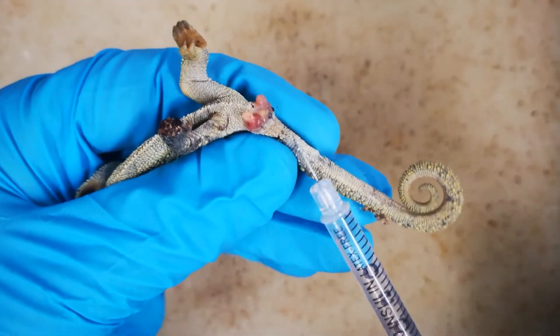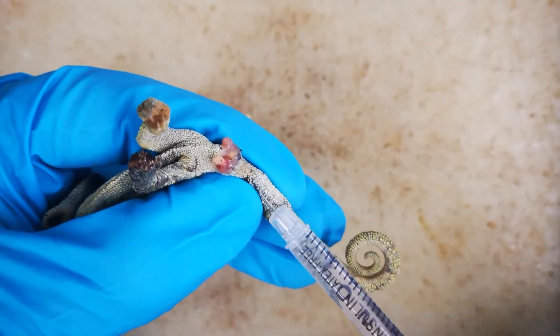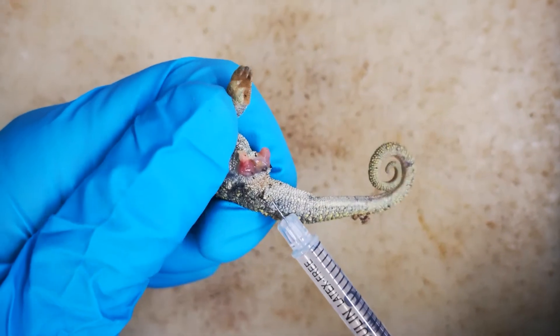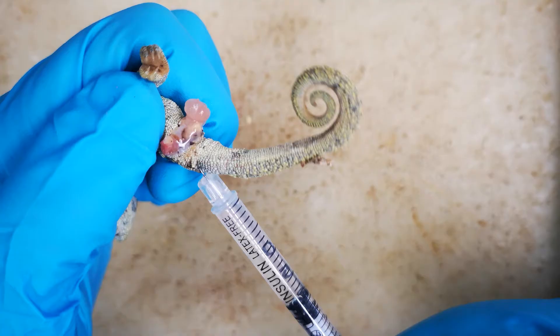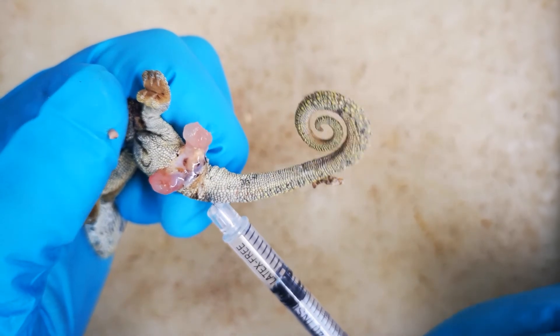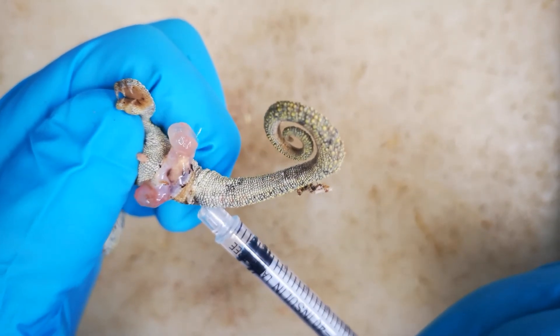To fully extrude the hemipenes, we will first use a syringe filled with water. You can also do this with high concentration ethanol straight away, but it is less forgiving of mistakes. The syringe is inserted toward the back of the hemipenial sac, oriented anteriorly so that the fluid is pushed into the hemipenis. It is useful to apply pressure at the hip joint to ensure that the fluid does not simply fill the body cavity, but is really directed into the hemipenes.